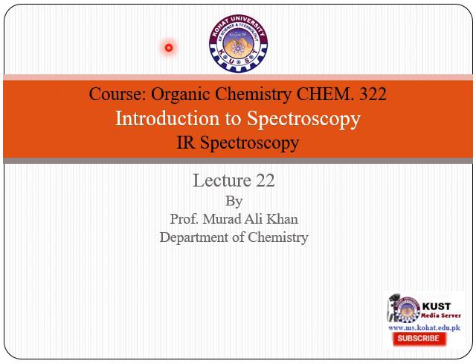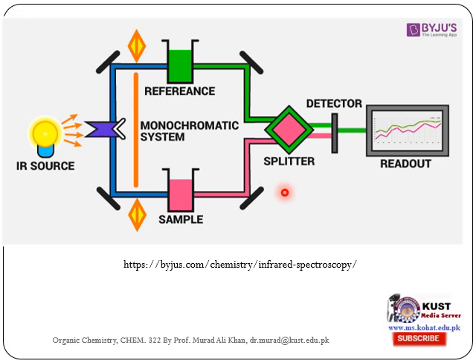Hello, dear students. Today we are going to discuss IR spectroscopy. This is a typical IR spectrophotometer, the diagram of an IR spectrophotometer.